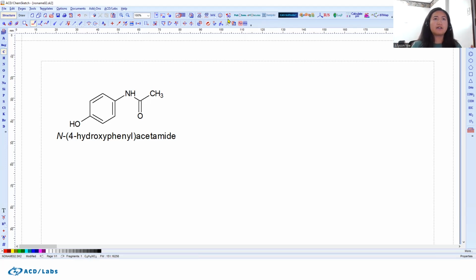And speaking of this top toolbar here, I also just wanted to highlight the fact that you can use these 4 database search engine options straight from the software toolbar. You'll see we have PubChem, eMolecules, ChemSpider, as well as the CAS SciFinder. If you click any of these, it'll take you into those database search engines, which I think is very handy as well.